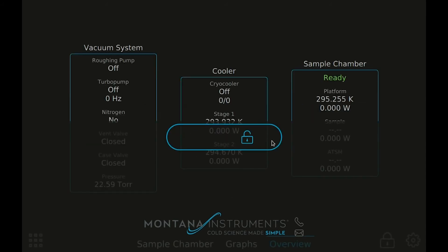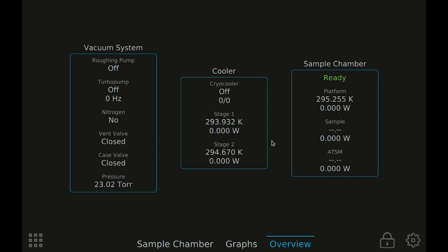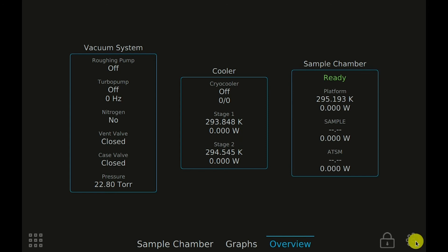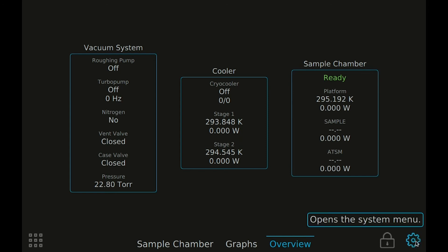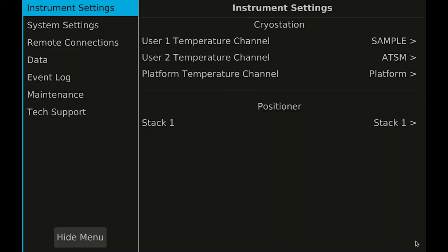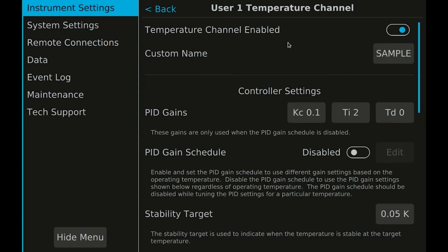Slide to unlock. Settings and less frequently used tools are found in the system menu. Various categories are found here to help you customize your instrument, view event logs, and download data. The instrument settings category is the place to find settings you may want to adjust to customize your system, such as renaming user temperature channels or adjusting PID gains.